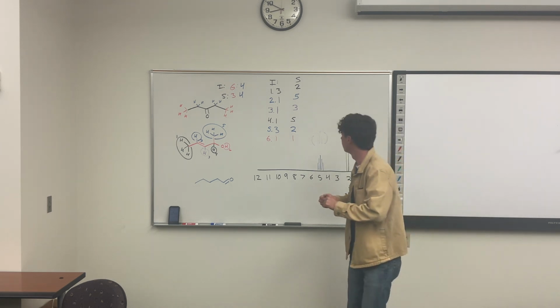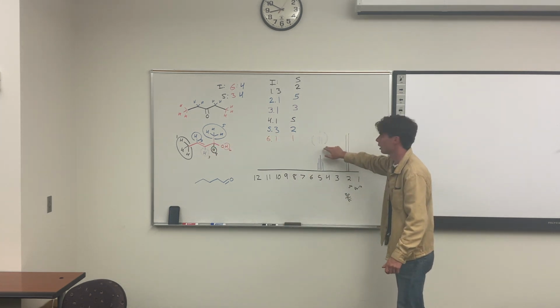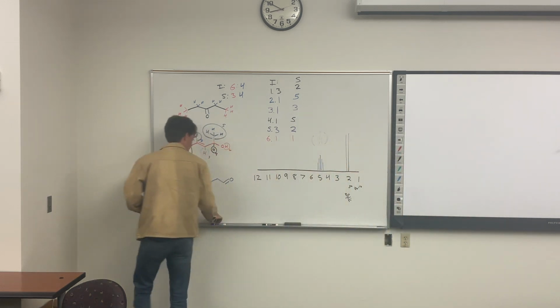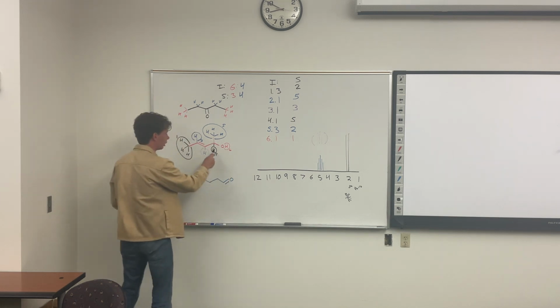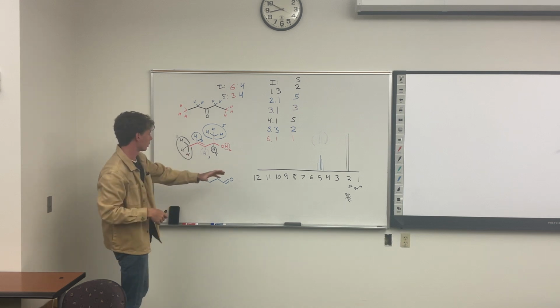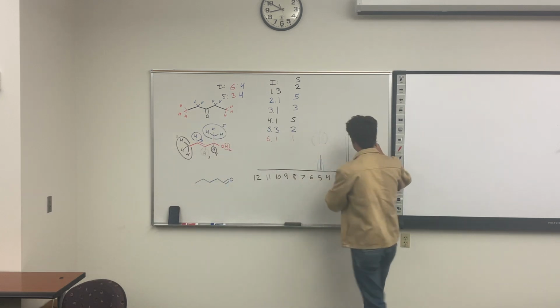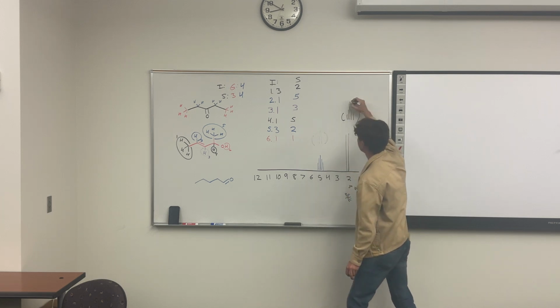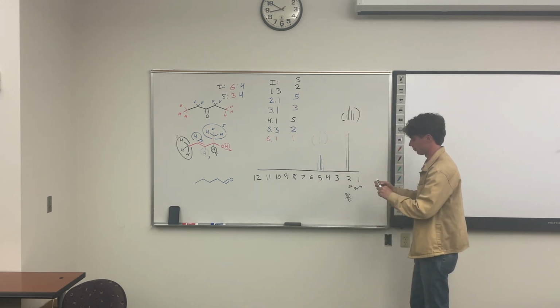But this is 3 signals and intensity of 1. Group number 4, hydrogen, allylic position. Notice, allylic position, 1 away from a double bond. So again, we're going to get some overlap. Intensity of 1 split into 5. Right around this area, we should also expect a short signal like this. Intensity of 1, split into 5, in the allylic position.